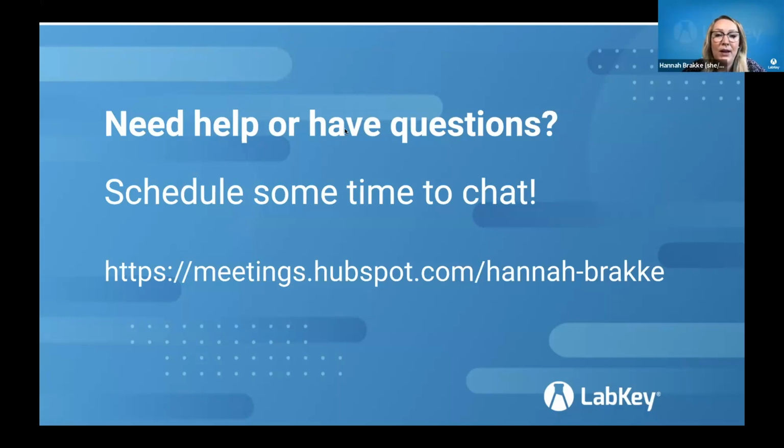Okay, and one last question here. Where is the data securely stored? If it's stored in the cloud, are there any rules around that? So I can help answer that. Yes, the data is stored on the cloud, and we use Amazon Web Services as our hosting provider. We do all of the management and security around this as well.